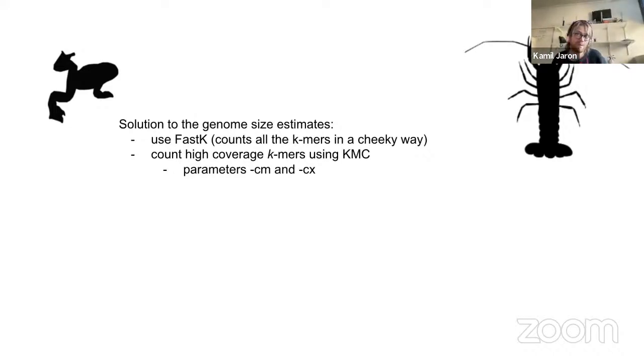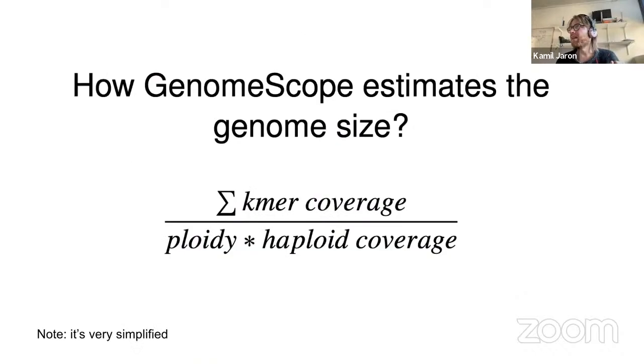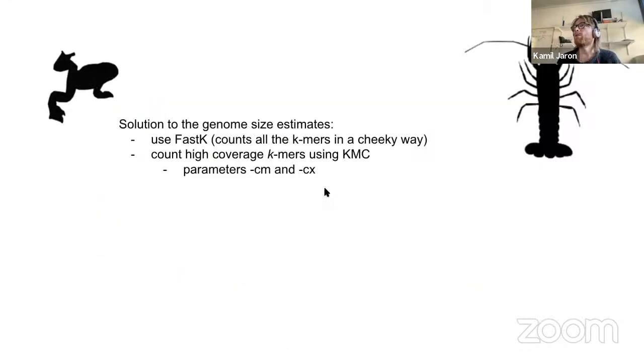So FastK did it like that. That's the smart way to go about it. We just have this dump bucket bin that although you don't explicitly know how many times individual k-mers were occurring, you know their total sum. You basically keep this equation for all the repetitive k-mers intact. So if you use FastK, just don't worry about repetitiveness.